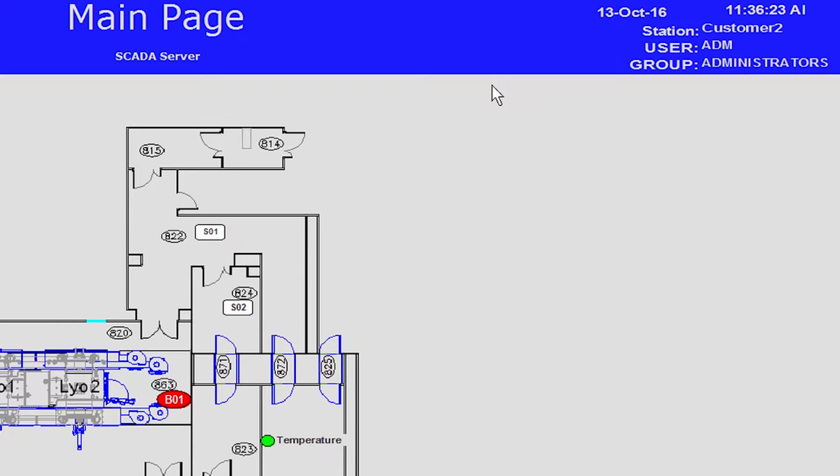The header displays information related to the system. It lists the current users logged into the system, as well as which machine the software is connected to. Additionally, it notes whether you are connected to the primary server or the backup server.